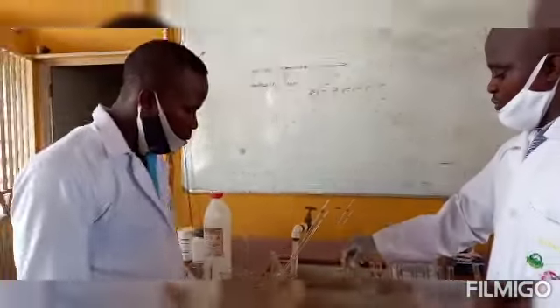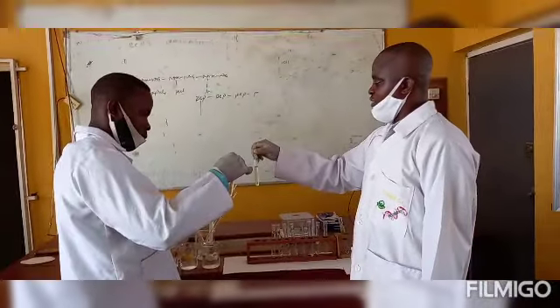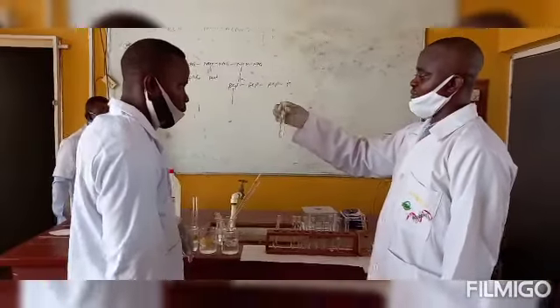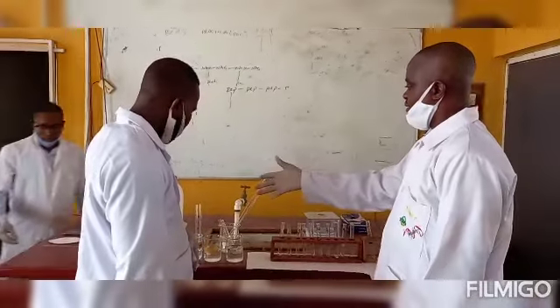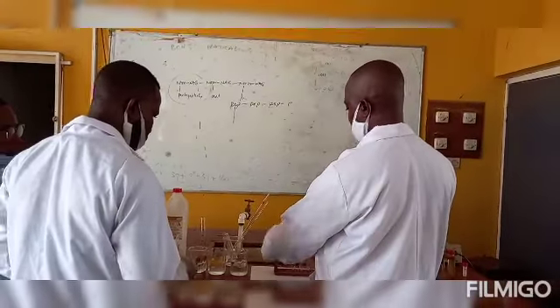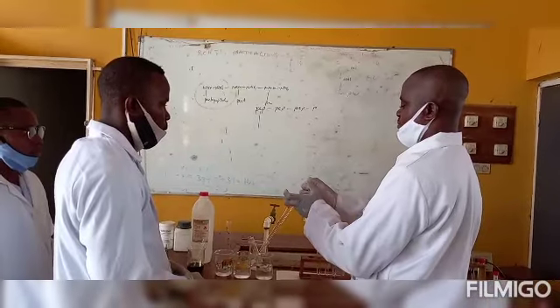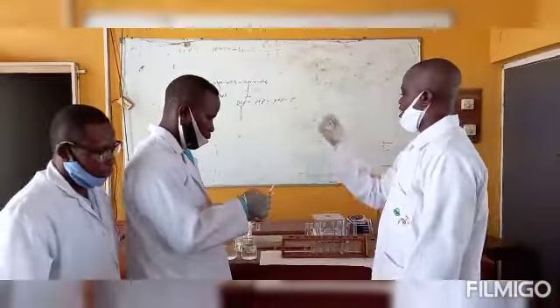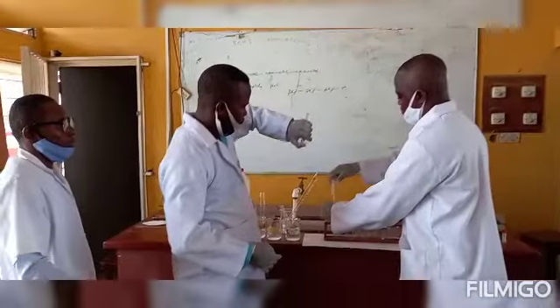Now that bromothymol blue indicator has been added into the content of each test tube, there will now be need to mix properly. As you can see, you need to mix properly. To achieve that, you take each test tube, cover it with cellophane, and you invert about 2 or 3 times, or even 5 times, to mix properly. You invert, then you return to the position.